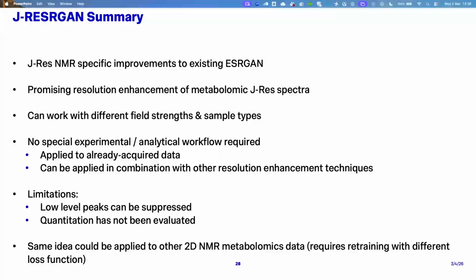Are the data exactly symmetric, or are there differences in noise and things like that? There will be differences in noise. We haven't explicitly taken that into account. We don't estimate the noise, for example, but because we're tuning the weight parameter, that does account for that to some extent. But yes, there are noise differences, and also in real data you tend to get some artifacts.